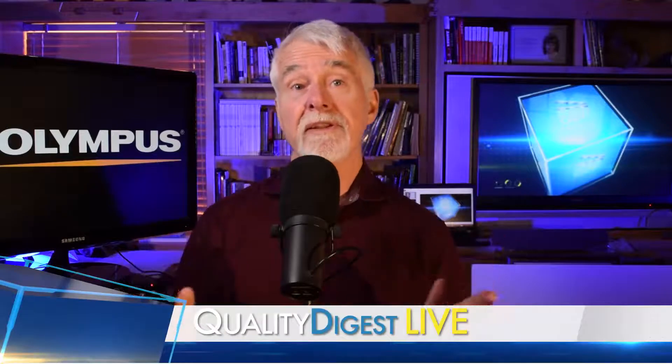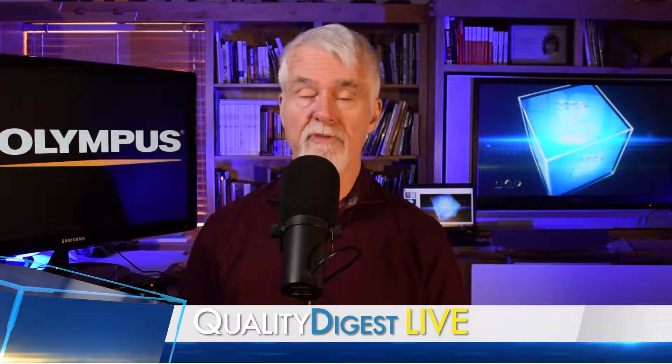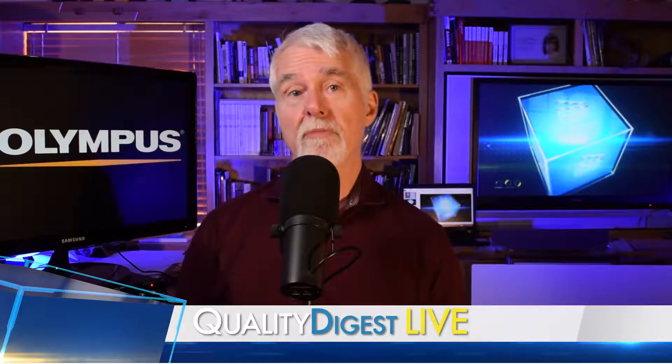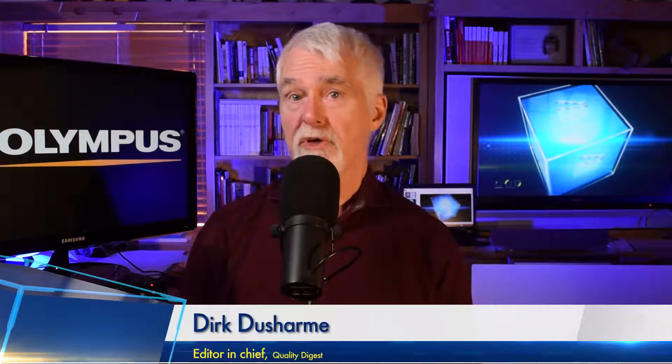Today on QDL, we take a look at the LEXT OLS 5100 3D laser scanning microscope from Olympus America. Built for failure analysis and material engineering research, the OLS 5100 laser microscope combines measurement accuracy and optical performance with smart tools that make the microscope really easy to use. Robert Bellinger of Olympus America showed us the LEXT OLS 5100 at their demo lab in San Jose, California.